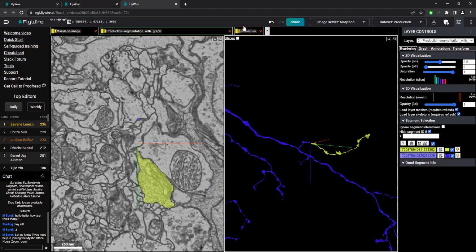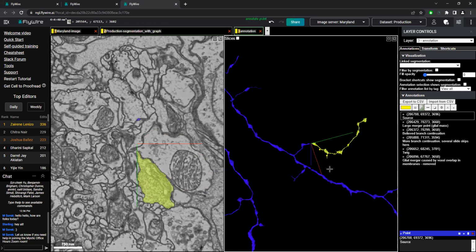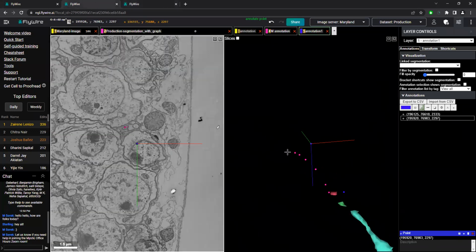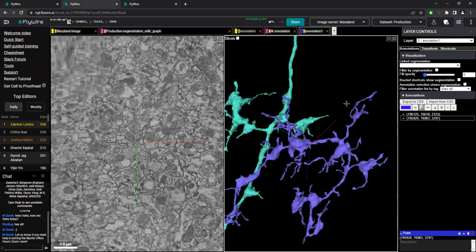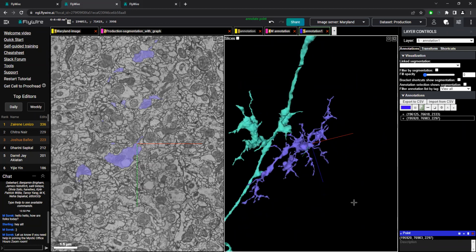And once again, I noticed here Azure J was using the annotations to make notes of where you've been and where you might have a possibility. So excellent, use that to your advantage for doing this, especially on these pieces like this. The example that Ankri gave, she was having trouble with finding where this thing went. And she used a bunch of annotation points to say, oh, I looked at this, these all don't work.